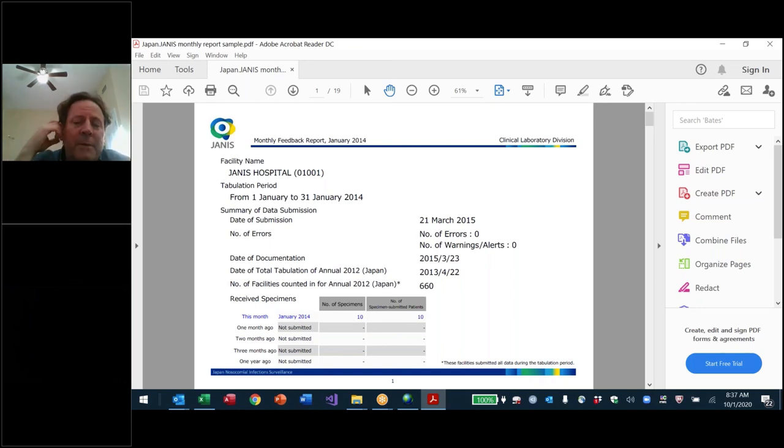Bangladesh has a very nice web platform for everything, but not antibiotic. Oh, I'm sorry, they have DHIS2 for most public health reporting, and they have made a nice web platform for antimicrobial resistance. It involves manual data entry from 9 pilot sites. This is also another good example to quote. They have nine pilot sites with 3 years of data. They're now in the process of expanding to about 40 hospitals.